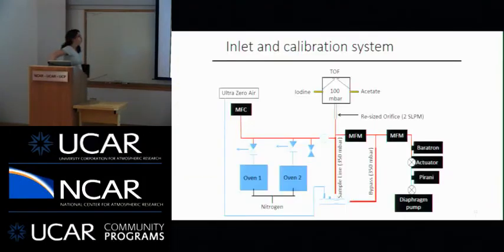And I'm not going to go through this figure because it's very detailed, but we went to a lot of effort to attempt to design an inlet system that would exclude particles, and I think we did a very good job of that. We also created an inlet system that would allow us, with a paranoia that was perhaps justified from my postdoctoral group, to quantify. We were so concerned that we went to huge efforts to figure out how to quantify our measurement with multiple techniques.